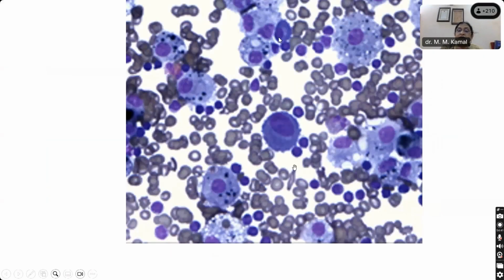Now, any difference in this cell? What are you seeing surrounding the cytoplasmic membrane? Blebs can be seen. Yeah, you are seeing blebs. Now, what are these blebs, and how are they different from microvilli? Blebs are nothing but a degenerative change in the cytoplasm. Microvilli are a component of the cytoplasmic membrane, and they are pretty long in hyperplastic and hypertrophic cells. Here you can see a little amount of pale cytoplasm, but at the periphery it is denser. And here the nucleus is just trying to touch the cytoplasmic membrane, but in this dimension, I'm unable to demonstrate that there is a space.